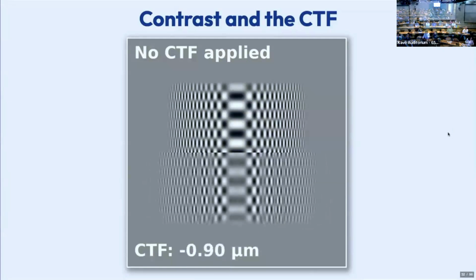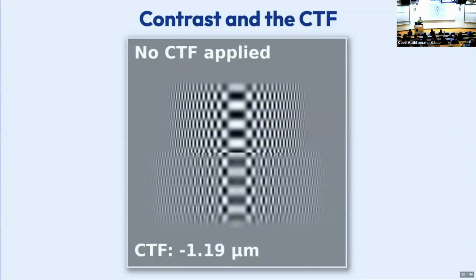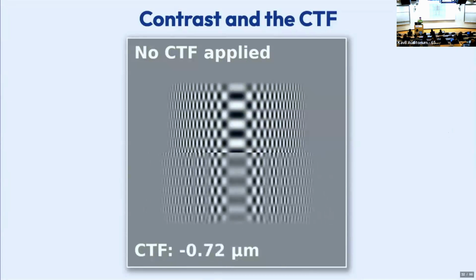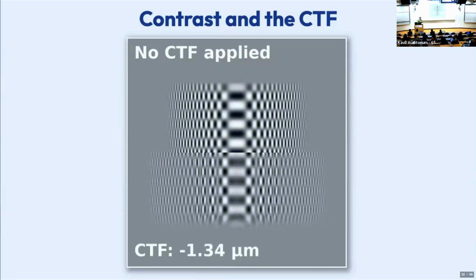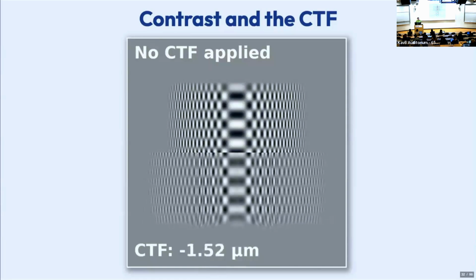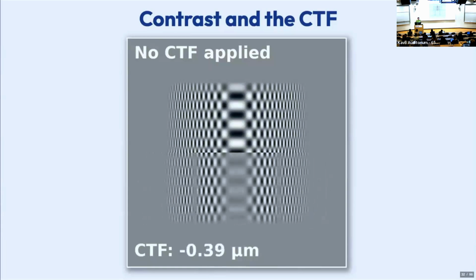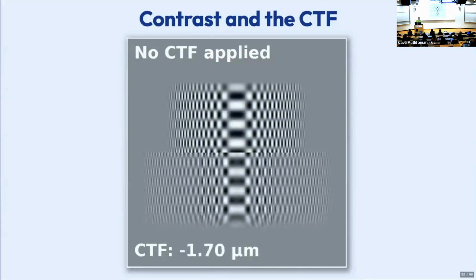Generally, the contrast transfer function doesn't change too much on the scale of a single particle. There are exceptions to that. Big viruses are the ones that come to mind, where they're so big that you're actually at meaningfully different defocus across the thing. That's called Ewald sphere correction, if you're interested. For things where you have a flexible domain that's hard to resolve, I wouldn't worry too much about the defocus. I would collect a normal, and what that means will depend on the sample, right, but a normal defocus set of movies.